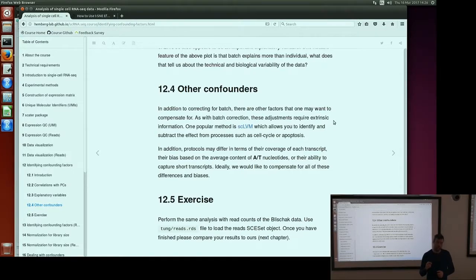Those are methods specific to cell cycle. You could also imagine other underlying processes affecting the transcriptome that we measure, like apoptosis or other biological pathways or processes that may not be of interest. In general, there's a whole area that tries to discover these hidden or latent factors, to identify things that could have large-scale effects on the gene expression measurements that we make, so that they can be included or modeled explicitly or regressed out in adjusted or corrected data that we put into downstream models.